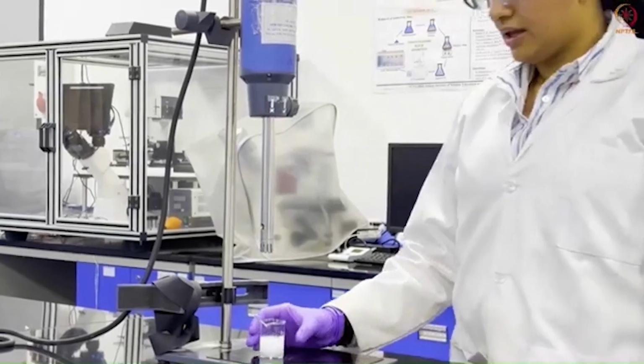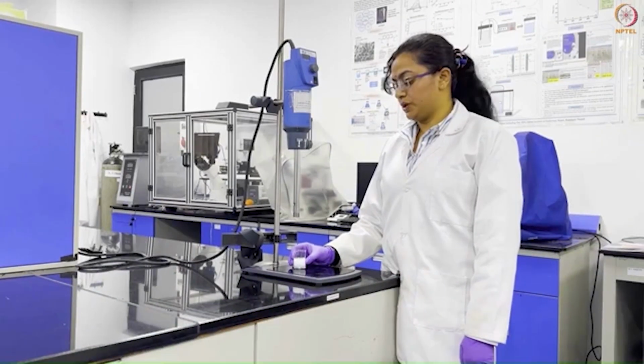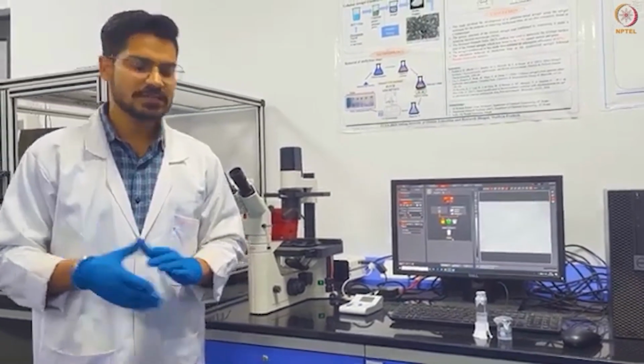Here we see that the emulsion formation has been obtained, which we will be analyzing under the microscope. Thank you. Welcome everyone. We are here to analyze the oil and water emulsion formed using the different emulsifying devices.